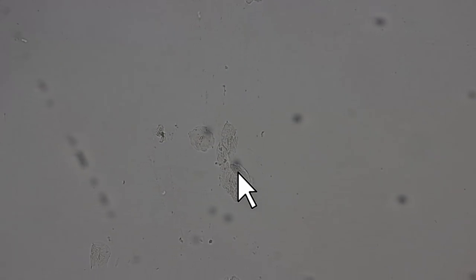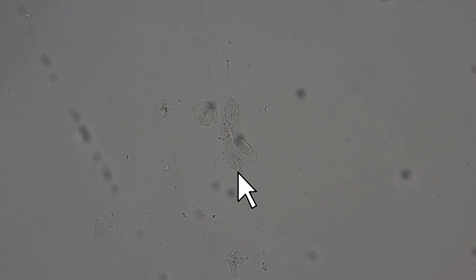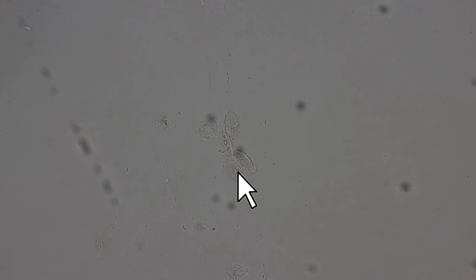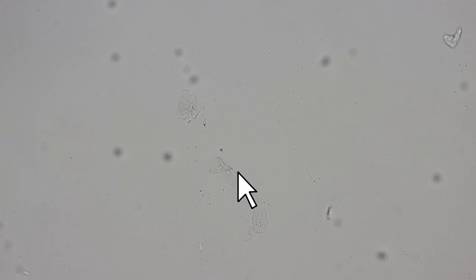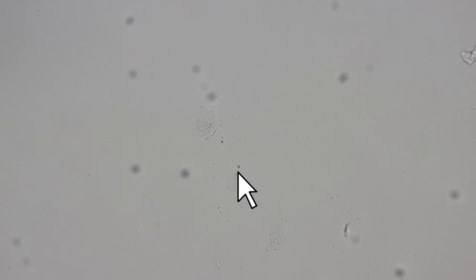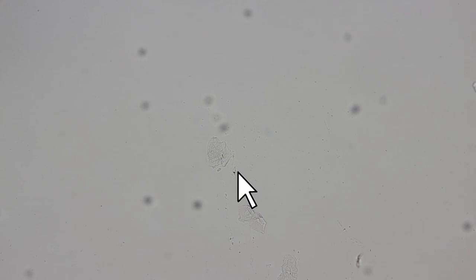Okay. And so you see the contrast is quite low. But it is possible to see them, of course. Actually, there are not that many cells here. When you scratch off the cells a little bit more aggressively using your fingernail, maybe you get many more of them. But here, for example, it's another one. It's another one. Just want to show you right now how it looks in bright field so that you're able to see the difference later on.